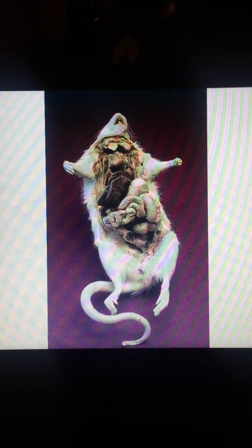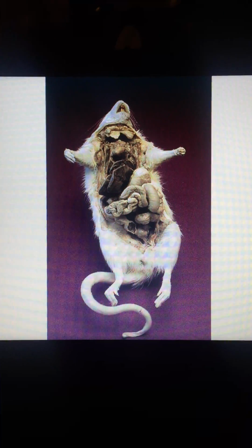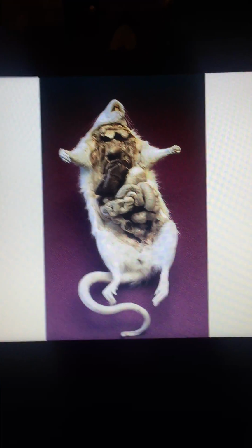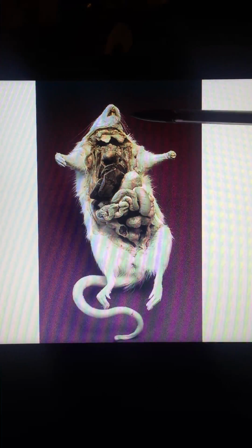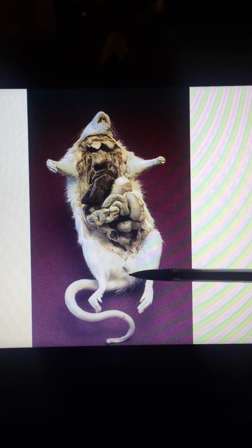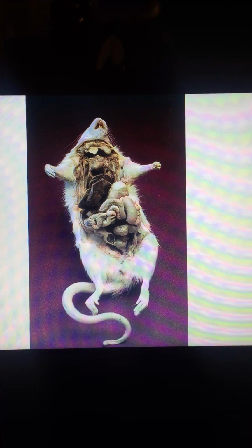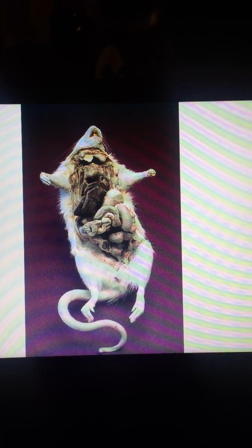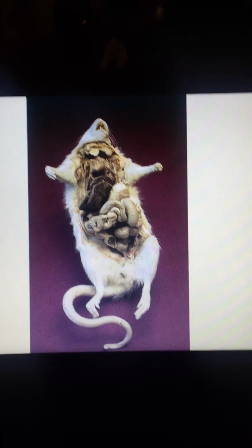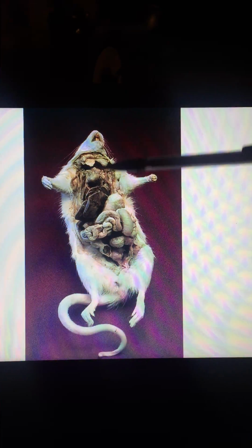So first, whenever I go in for a dissection or a checkout, and I know this sounds probably pretty simple and common sense, I just always want to quickly orient myself. All right, up here is the head of the rat. Down here is the butt of the rat. Now, I realize that sounds dumb, but it makes a big difference when I'm trying to think to myself, where are certain organs placed? I always want to remind myself up here between the head and the arms, this is the chest of the rat.